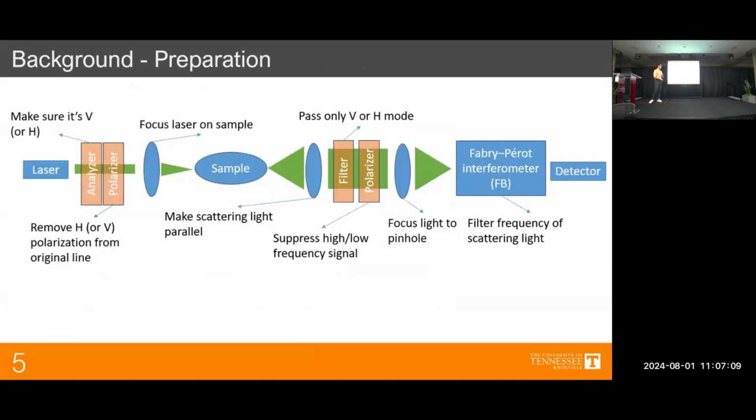To actually get this whole Brillouin light scattering to work is a big logistical nightmare, because you first have to clean up the laser, focus the laser, then hit the sample, then contain the scattering, and then do more filtering and polarizing, and then you can finally do some acquisition. This also has to be completely in three-dimensional space. For some context of how complicated this is, I made a manual to help future interns on this whole process. It's about a 20-page manual to fully get this thing set up. So it's quite a big process.